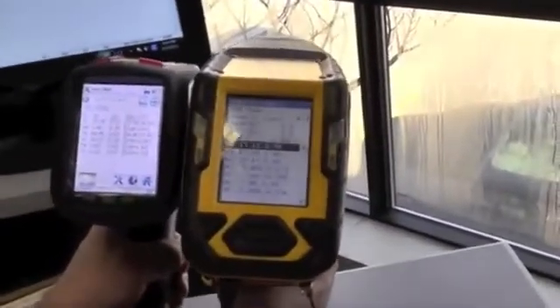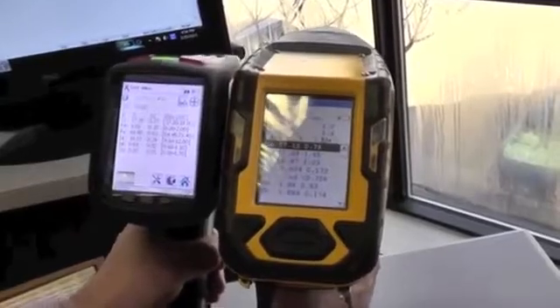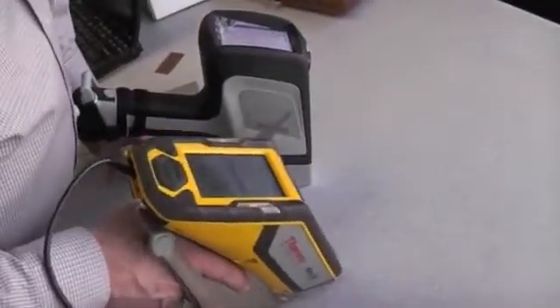Another thing that is significant is the brightness. Take a look at the two displays and you can see how much brighter it is. Niton has better battery life, but part of the reason they have better battery life is that their display is running at about half the visibility than ours does.